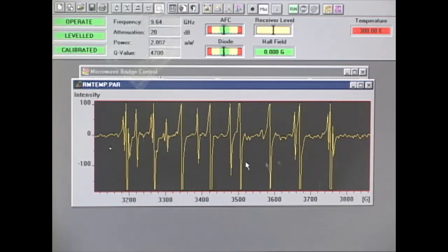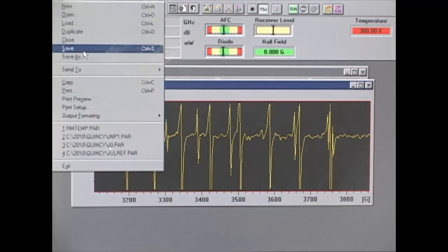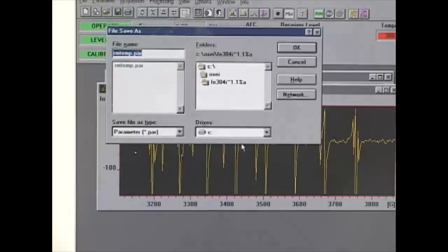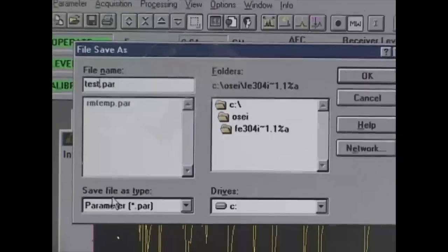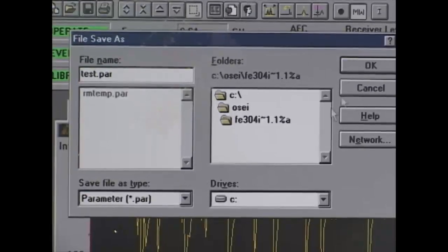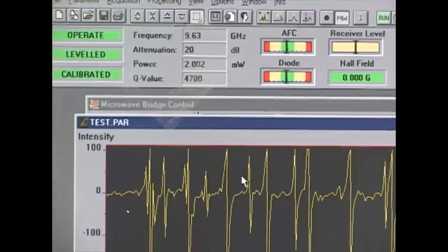Now that we have a signal, we can click file and save. We can change the file name to text and click OK to save the file.